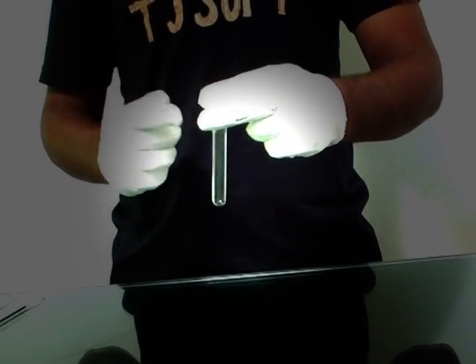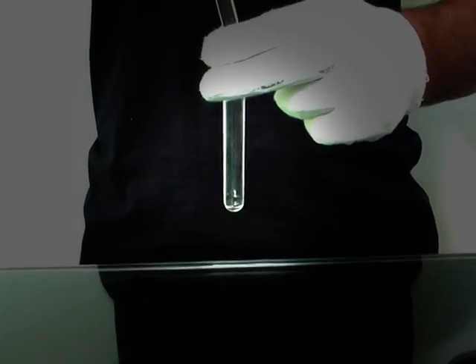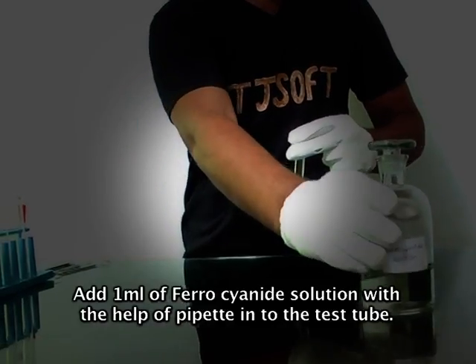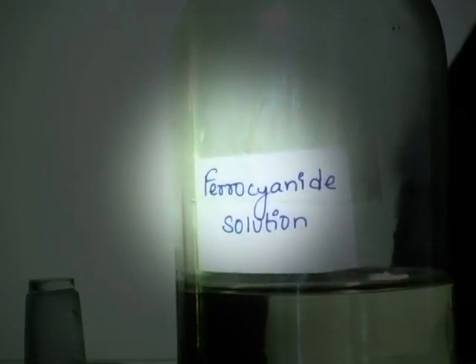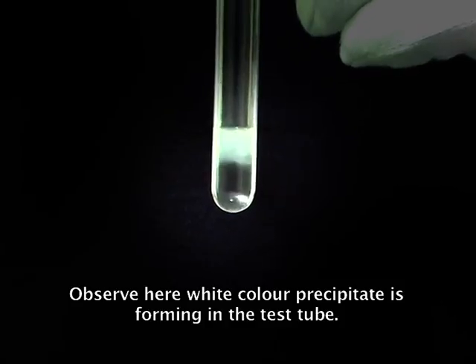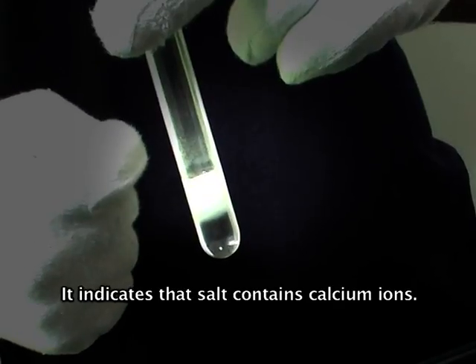Now take another test tube. Now take 1 ml of original solution into the test tube. Now add 1 ml of ferrocyanide solution with the help of a pipette into the test tube. Observe here — a white color precipitate is forming in the test tube. It indicates that the salt contains calcium ions.